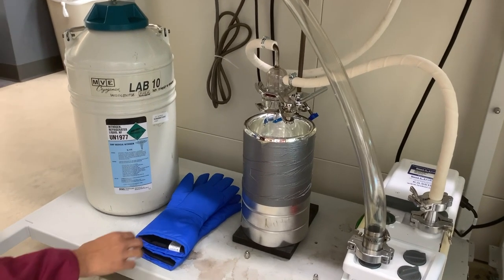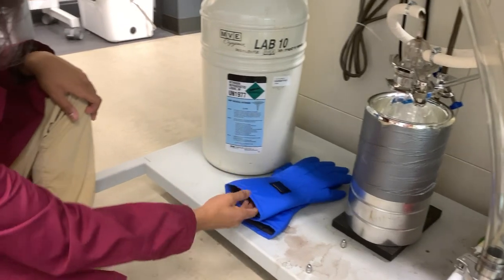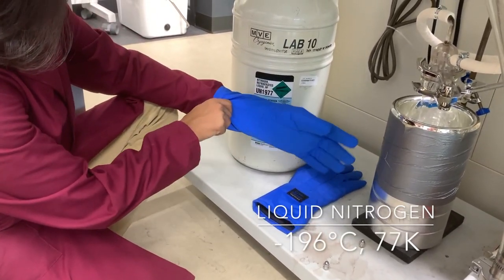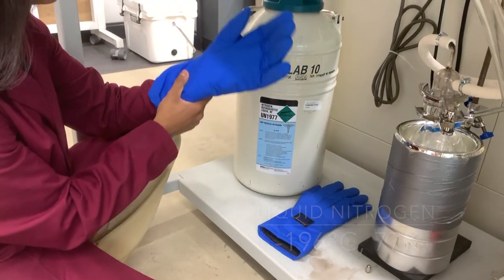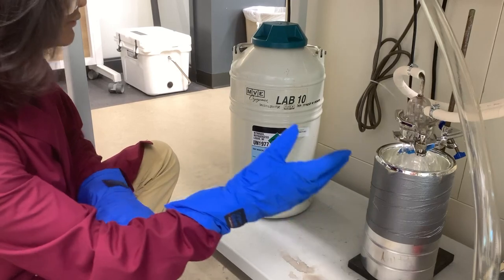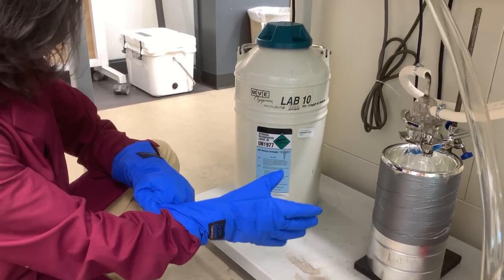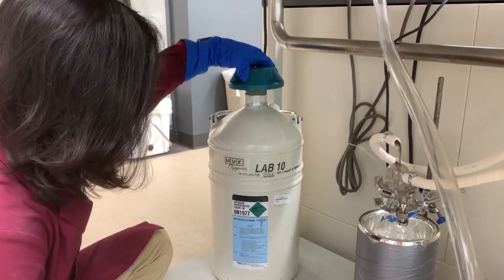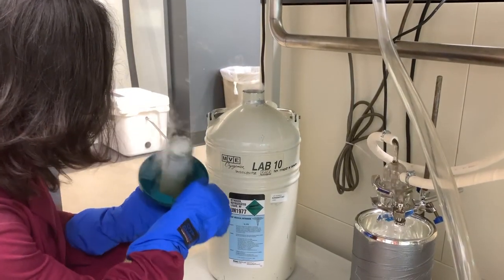Safety note: liquid nitrogen is negative 196 degrees Celsius — or 77 Kelvin for those who prefer that scale — which is closer to absolute zero than it is to room temperature. Skin exposure to liquid or even vapors could result in frostbite, so put on approved gloves for working with cryogens.